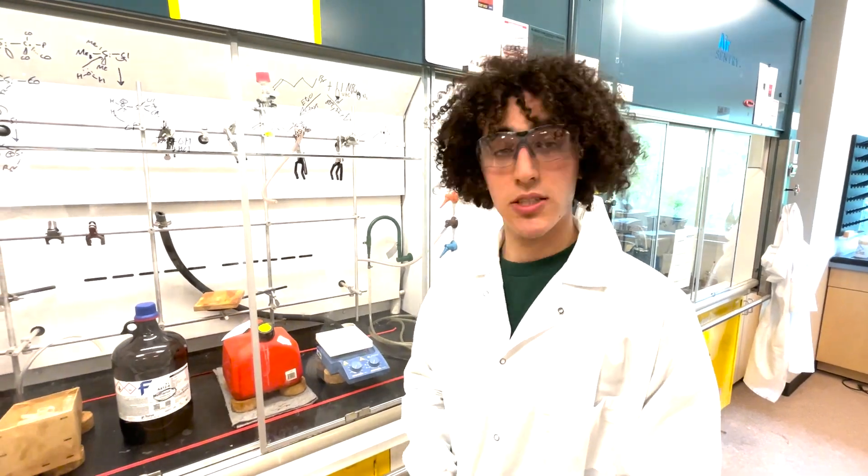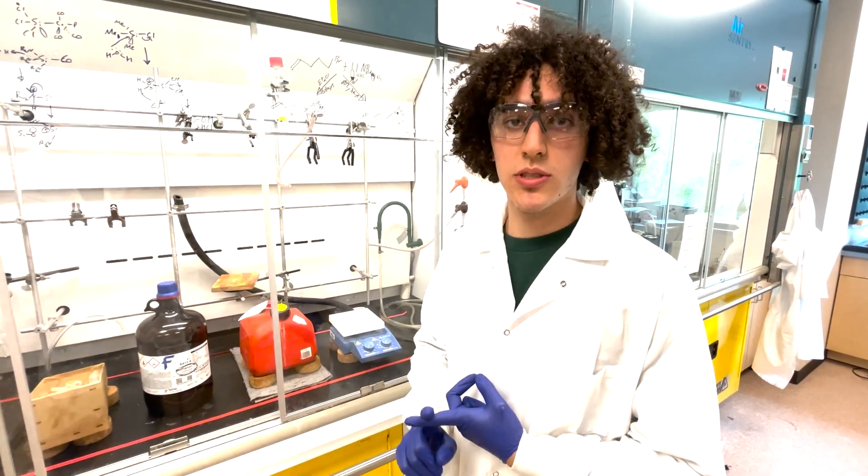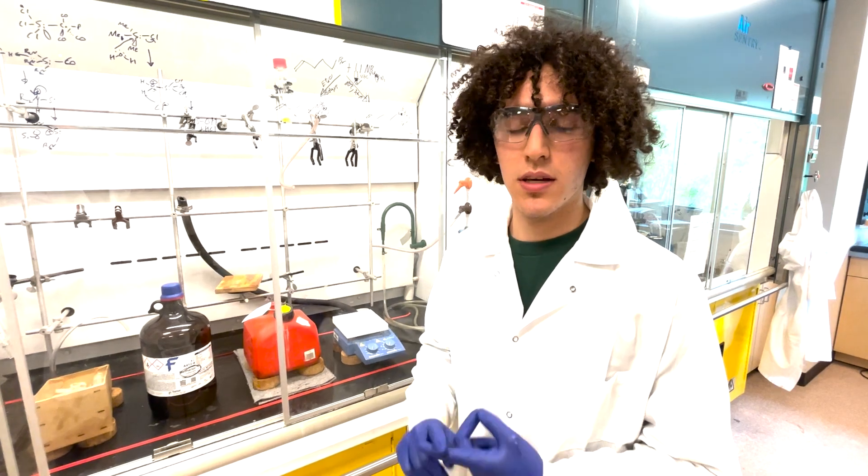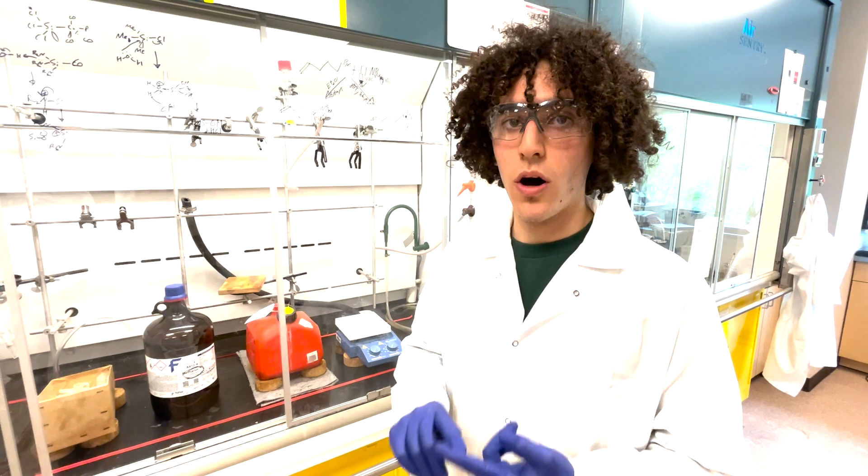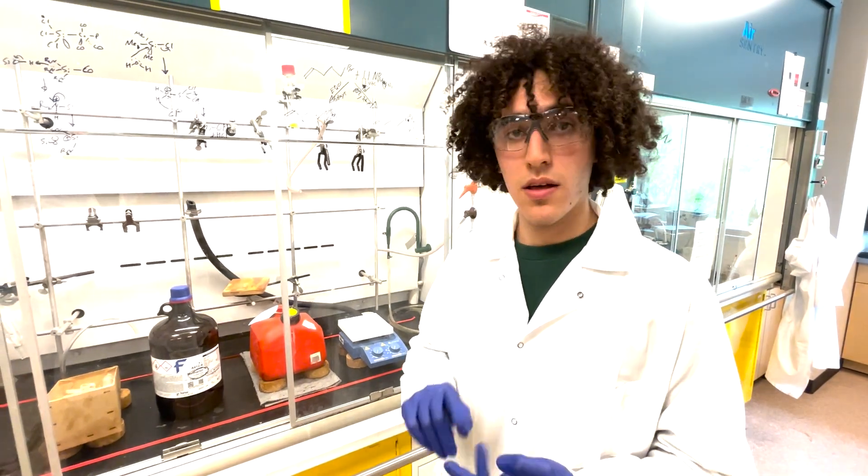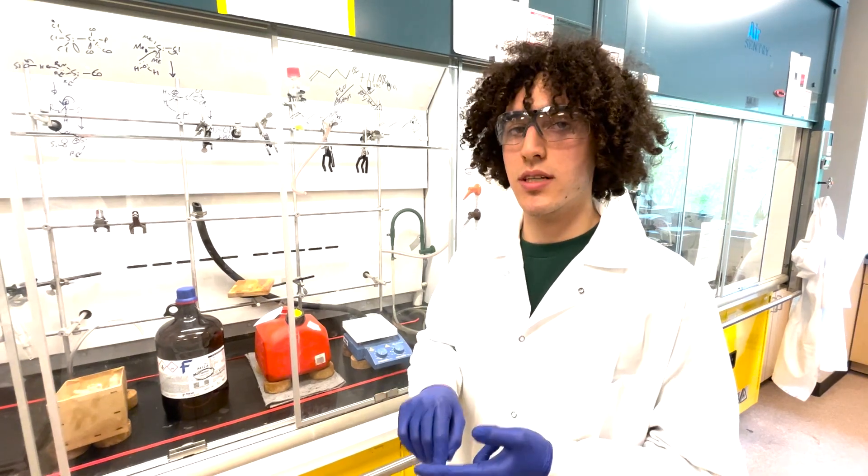Some final safety considerations for fume hoods are that radioisotopes need to be used in their own designated fume hoods. Same goes for perchloric acids which need to have a fume hood with vapor washdown abilities. We also need to have biohazardous materials handled in their own safety cabinets.